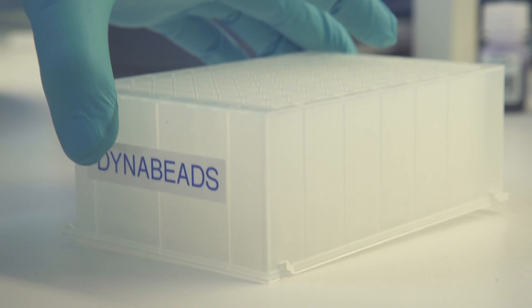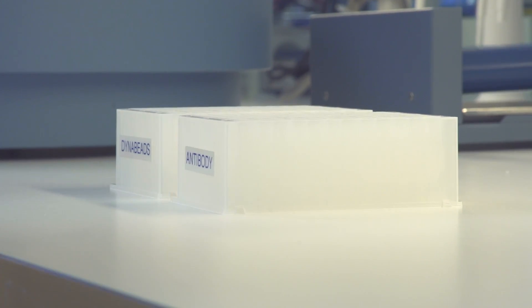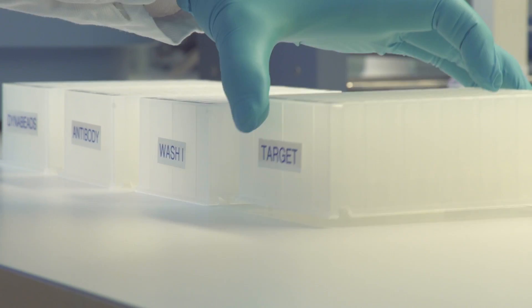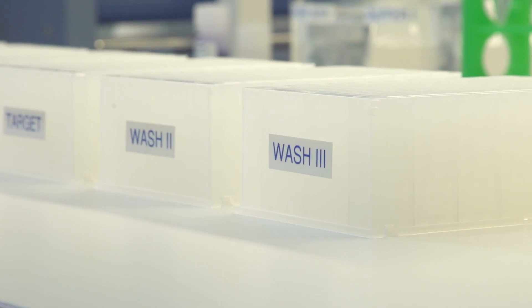The initial step is to prepare seven plates containing DynaBeads, antibodies for target capture, washing buffer, sample, washing buffers, and elution buffer.